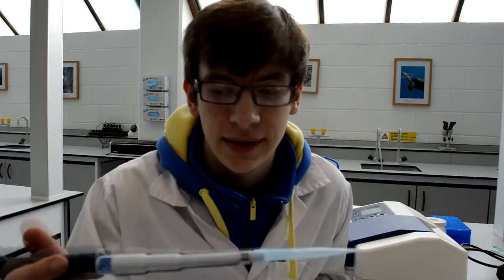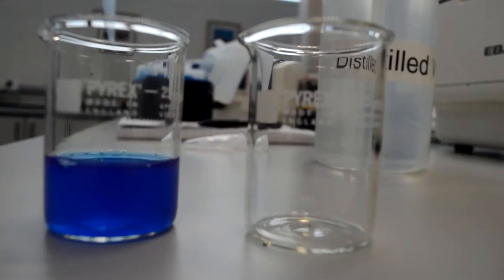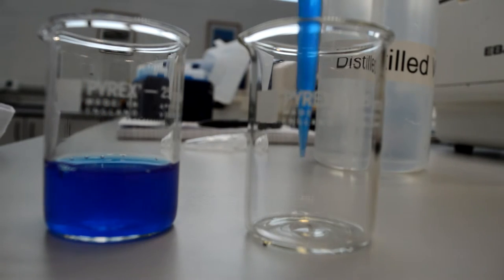So once you've done that, the next step is just simply to push the plunger down on the top, and that just forces the air out the end of the pipette. After that, you just insert the tip into the liquid, slowly release the plunger to pull up the liquid again, and you'll pull the liquid into the tip of the pipette. Then you just take it into another vessel and push the plunger down slowly to make sure you get all of the air out.